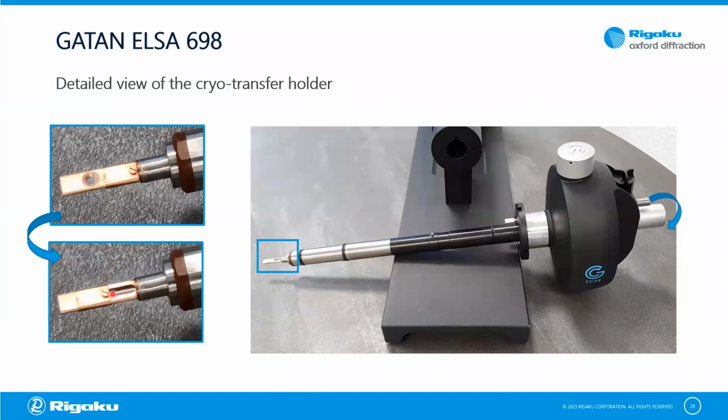It's a shutter that can be operated from outside and can close above this little sample space here. This is important because if you have the sample in here, you need to transport the holder through air from a protected environment with cold nitrogen vapor or even liquid nitrogen, where you do the sample transfer into the diffractometer.